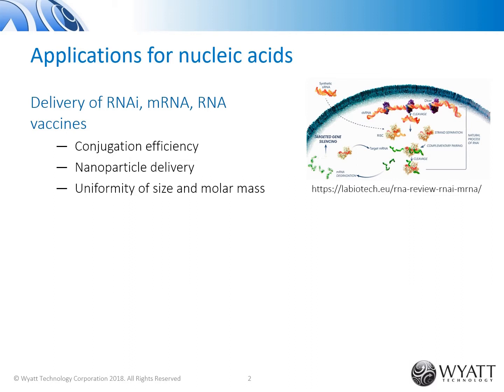So this involves delivering RNA to T cells or other immune cells and transforming them into tumor targeting agents. And the delivery is really crucial for this process. So biophysical characterization is required to understand the properties of these drugs. For example, the delivery efficiency could be dependent on how much polymer is conjugated to your RNA. Or maybe you have a purification or formulation condition that causes your single-stranded RNA to form duplexes and other large aggregates that you don't want.